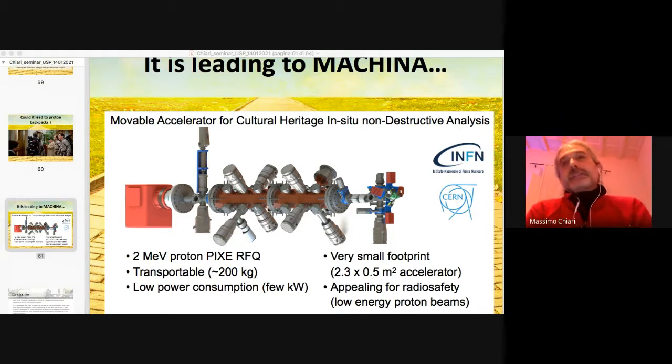But typically, we also had an XRF system that was used to determine, for example, the high Z elements in the samples, because it was more sensitive than typical PIXE measurements with Si(Li) detectors.